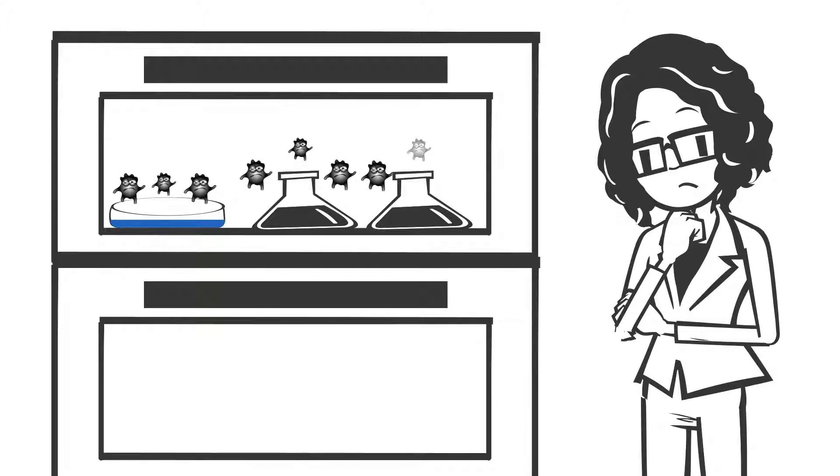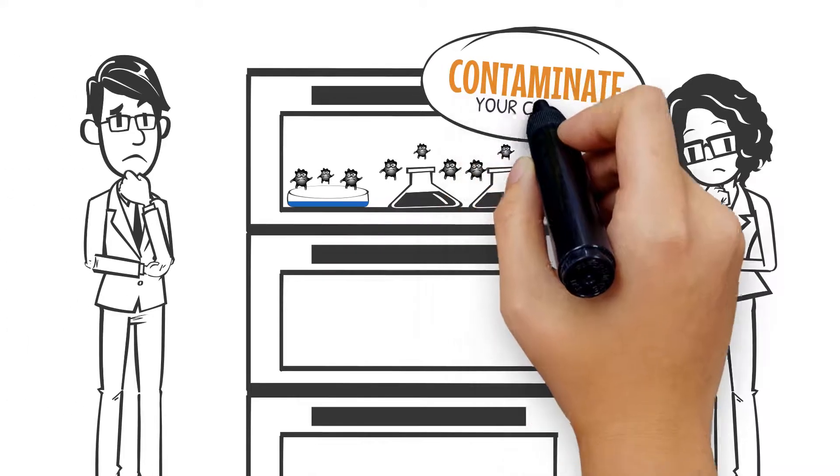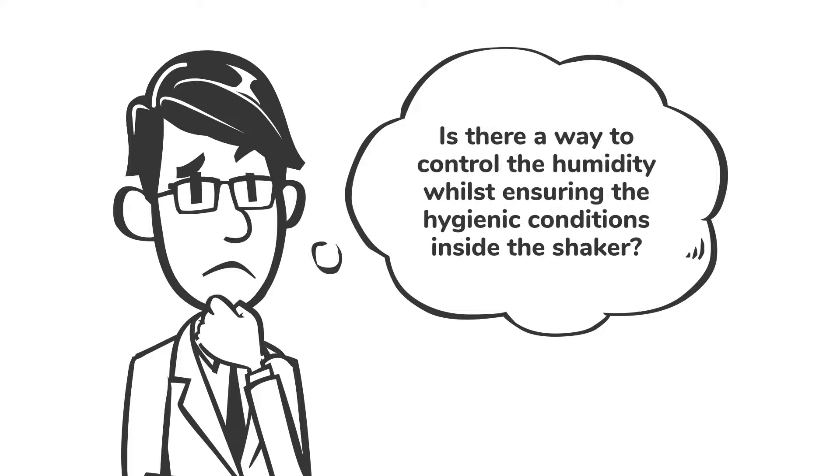Both the condensed water and the water in the container can be a breeding ground for mold, which could contaminate your culture. Is there a way to control the humidity whilst ensuring hygienic conditions inside the shaker?